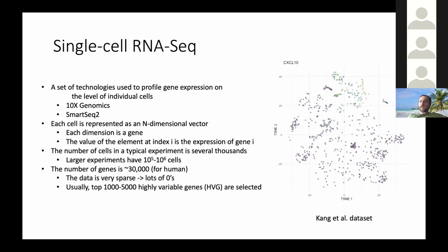So here in the picture, we see a t-SNE plot. That's basically a graphical representation of the data sets, a nonlinear dimensionality reduction method.